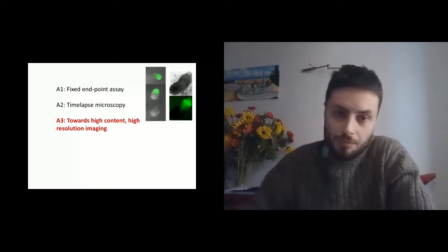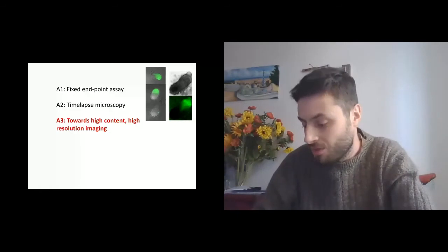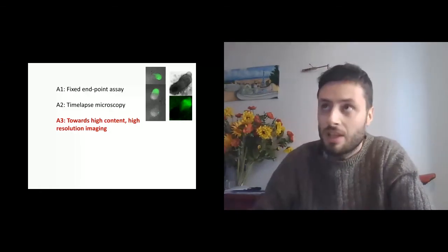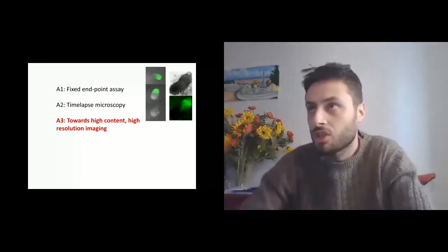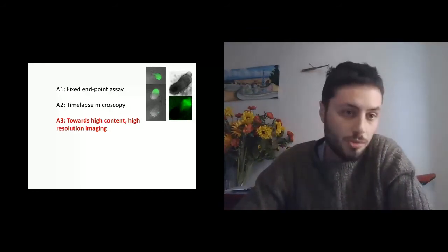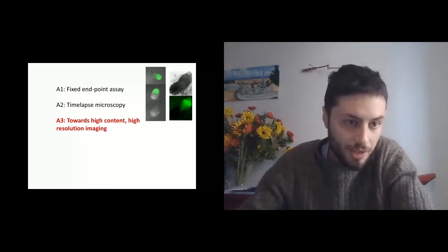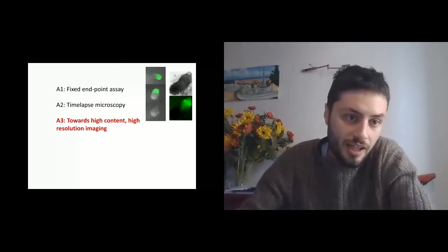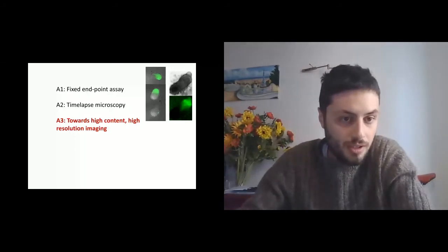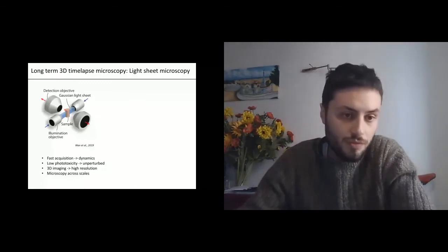So, of course, besides HCS, there is a full advanced optical microscopy field, which makes use of additional imaging modalities. And I would like just to highlight light sheet microscopy, this technique which you might be familiar with, that allows you to decouple the illumination part of the imaging from the detection part, and this gives you some very nice features of your imaging device.